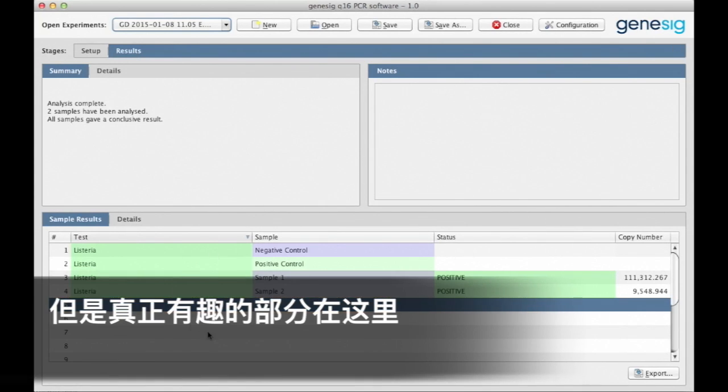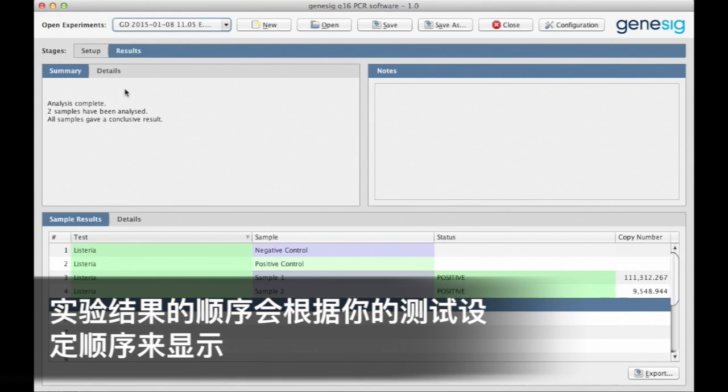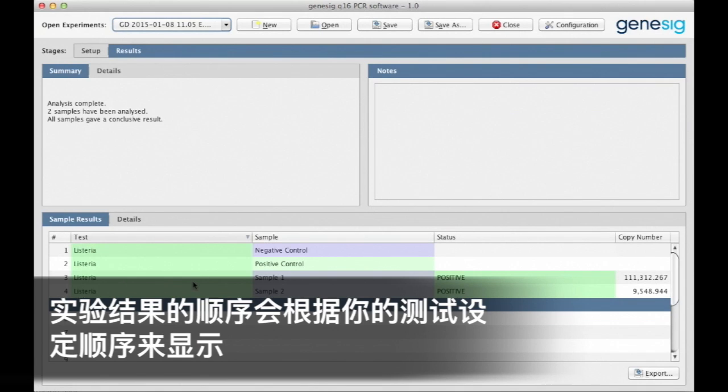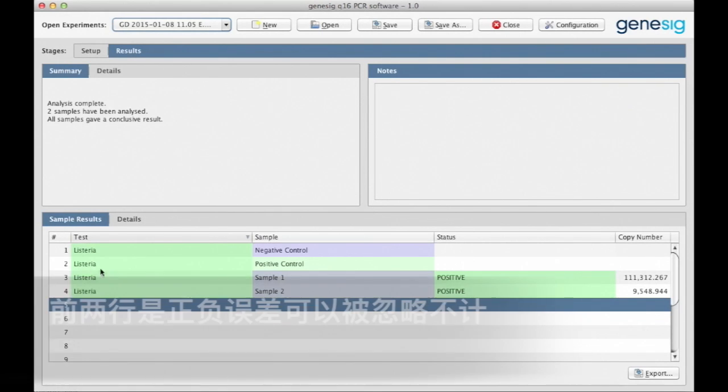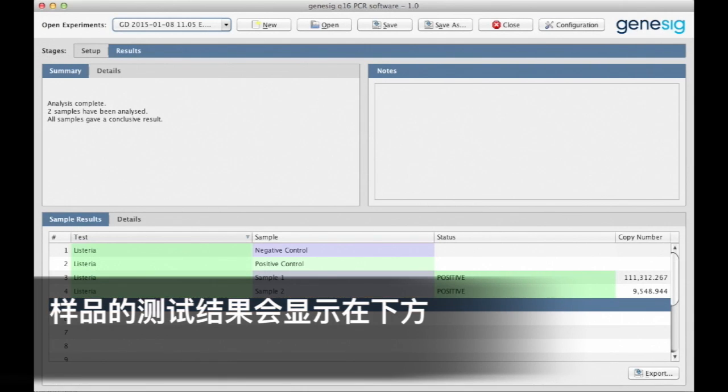But the really interesting bit is down here. Here are the results. The results are presented in exactly the same order that you arranged them during test setup. You can ignore the top two rows as these are your positive and your negative controls. The results for the samples are displayed underneath.